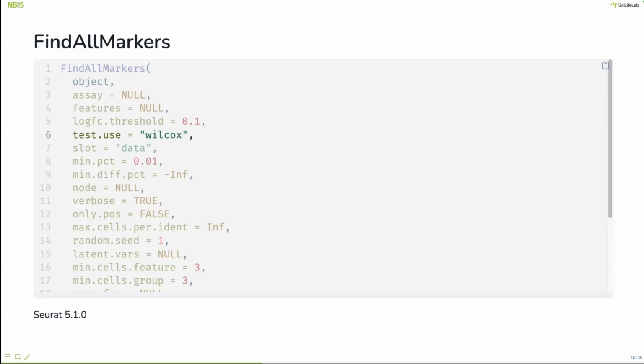Can I also just add a comment that most of these methods we use for integrating are not producing corrected count or data matrices. So there is nothing to test for differential expression. There's not a corrected gene expression from the integration. And then, of course, we have to go back to the RNA. We use the clusters we got from integration, but we use the raw RNA. Thank you.